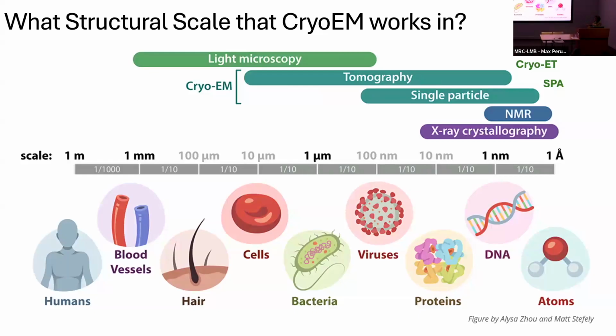I think it's still difficult to see, but single particle approaches it. Single particle analysis cryo-EM cannot look at anything too big. 100 nanometers is almost the limit for 300 kV electrons to penetrate. But the very small ones, single particle also cannot see. Before we said 50 kilodalton, and now some people can achieve 30 kilodalton.